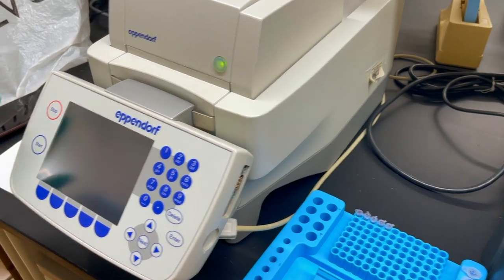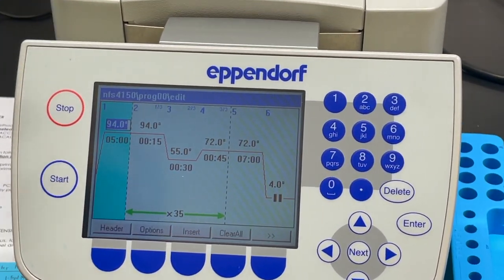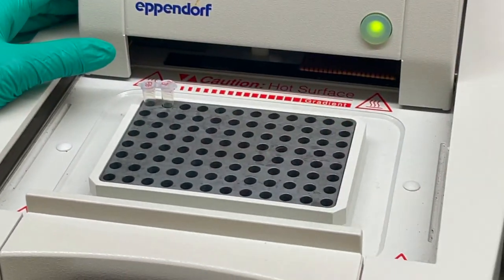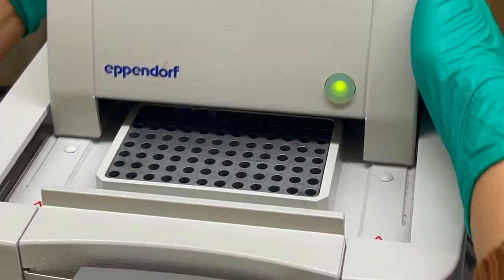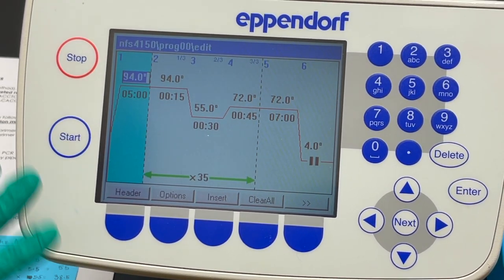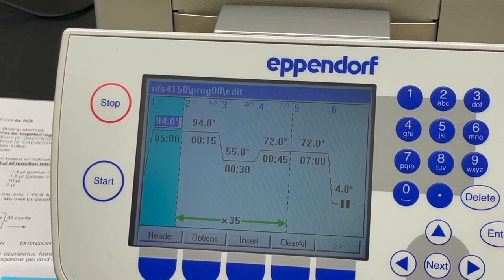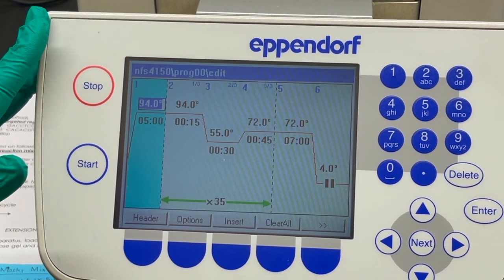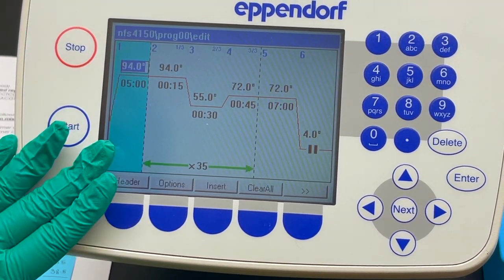We now have all five solutions ready. This is the thermocycler we will use to amplify the E. coli DNA. We place the samples into the machine and close the lid. The PCR will amplify the specific portion of DNA where both primers anneal, and it works only for DNA — not RNA or other molecules.